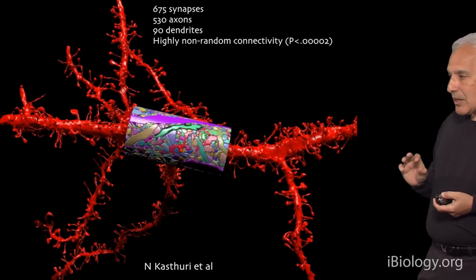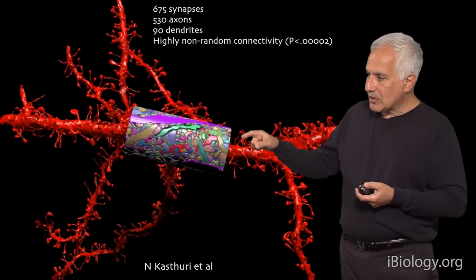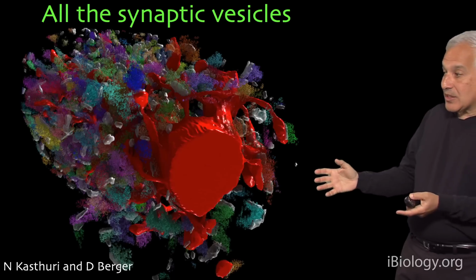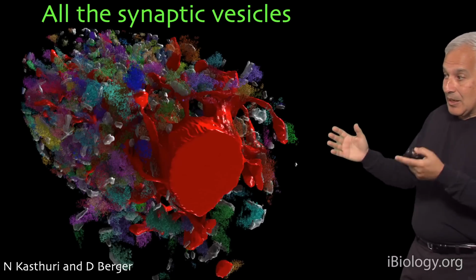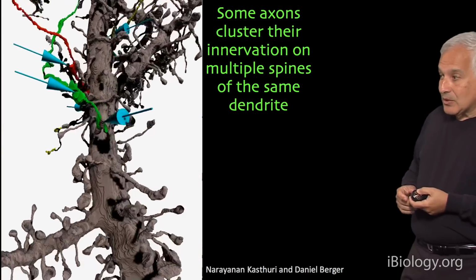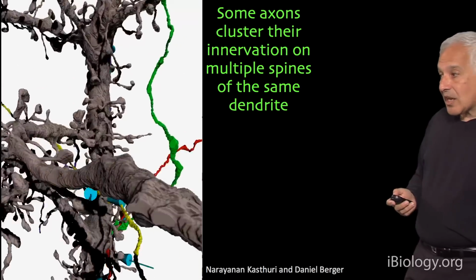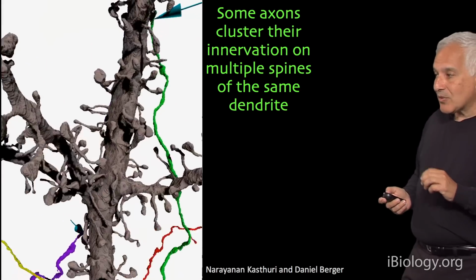You can see that by tracing out a single axon, but I want to give you a sense of what it means to have 675 synapses in one little area like this by showing you all the synaptic vesicles of all the synapses in that area. You just have this cloud of synapses around this dendrite, and many of those synapses are not on this dendrite. This dendrite only has 80 excitatory synapses on it, but there are about 600 synapses in that region. If we look at a single axon at a time, you see that many of these axons seem to have some special affinity for this dendrite, and other axons have a special affinity for other dendrites, even though they're all excitatory axons.